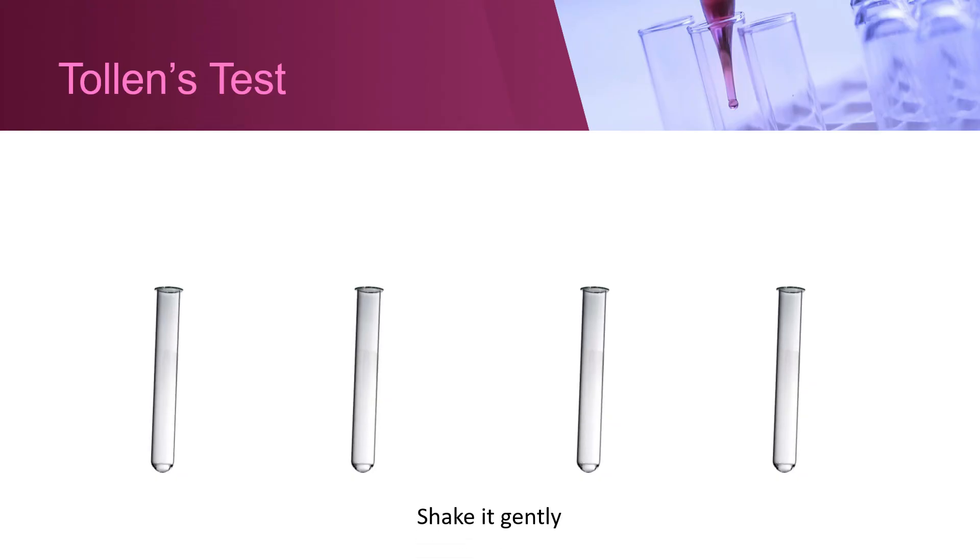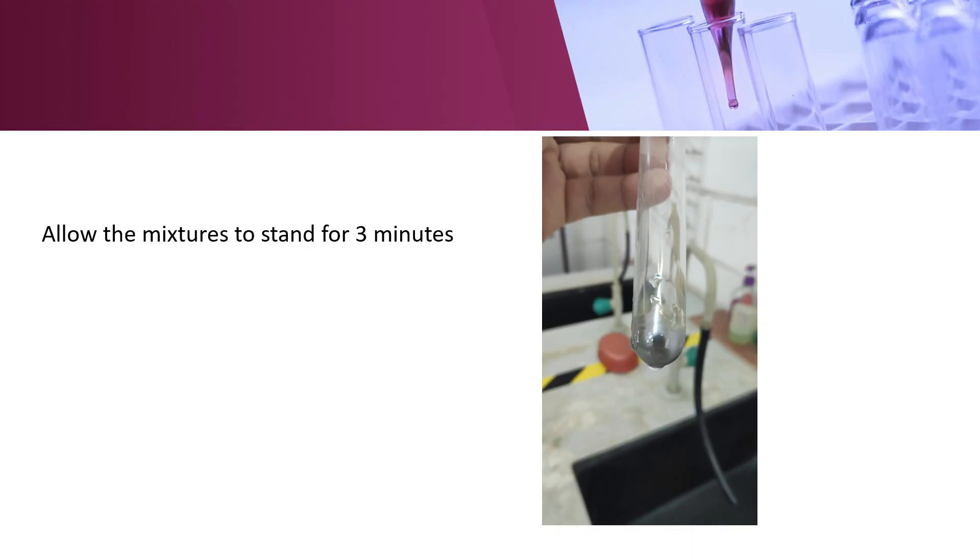Shake the mixture gently. Allow the mixture to stand for three minutes and observe whether a silver mirror forms in any of the test tubes.